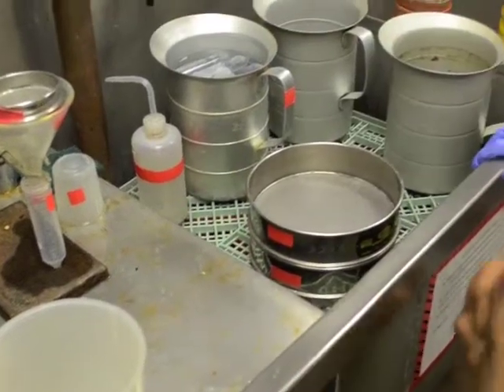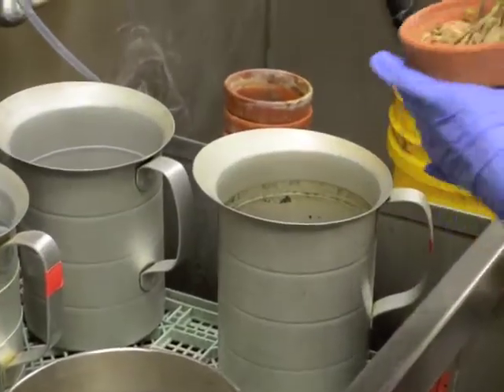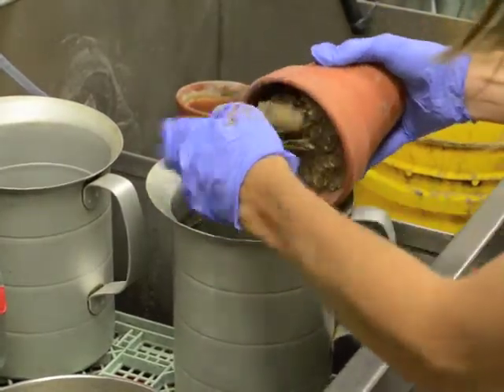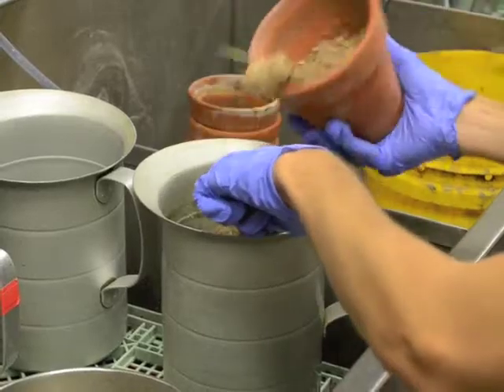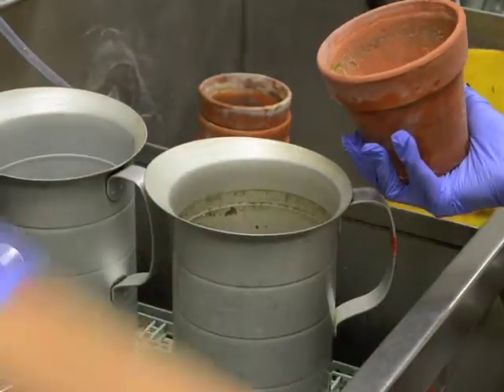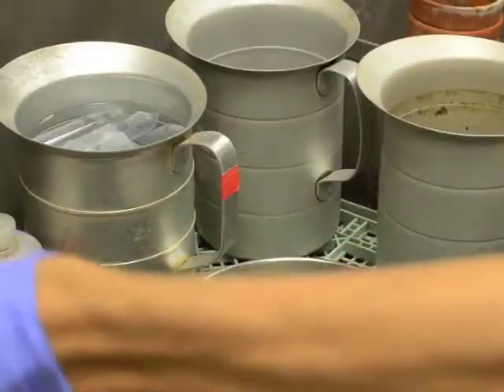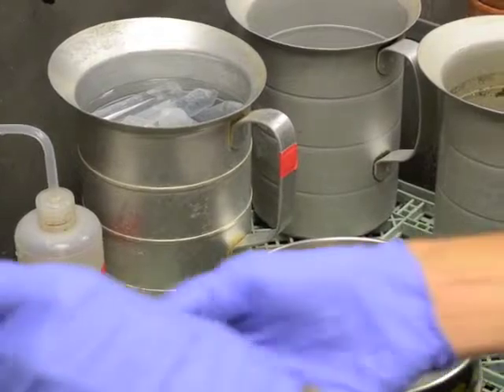Carefully remove the roots of the plants from the existing soil. Remove any excess soil from the plant roots before proceeding.